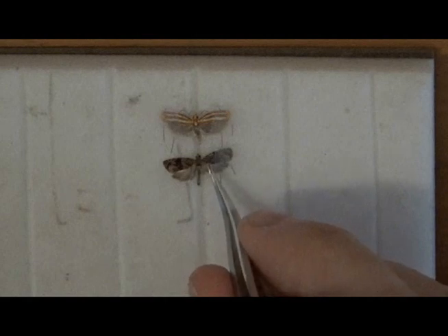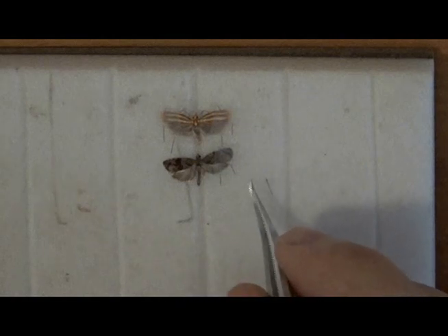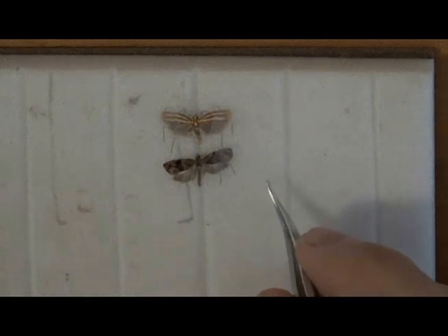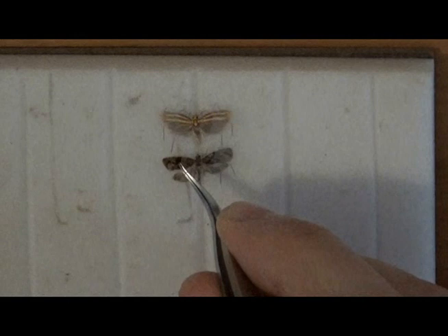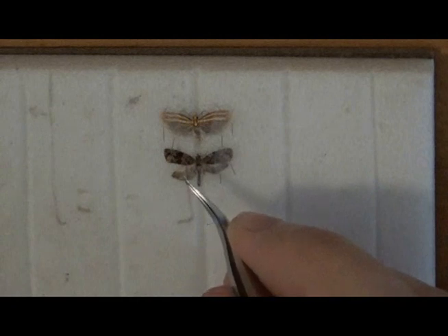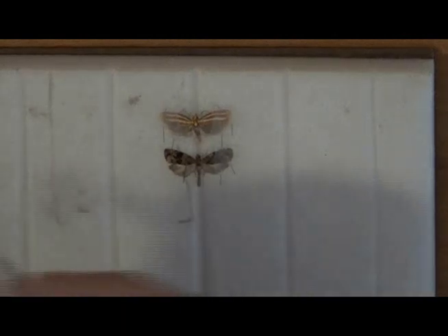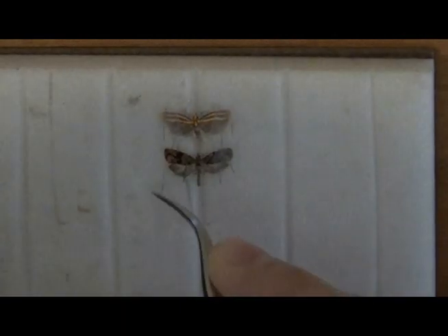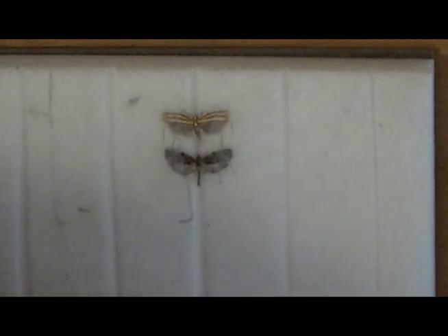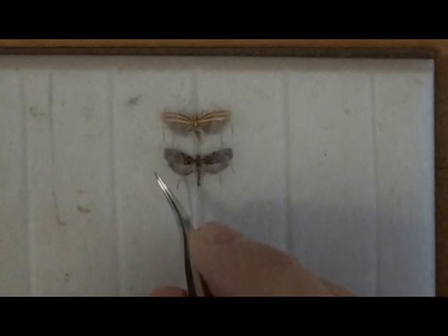I then remove the two original minutens that I used to position the wings. If I want, I can use an additional minuten to position the antennae. I then do the same with the other wings.